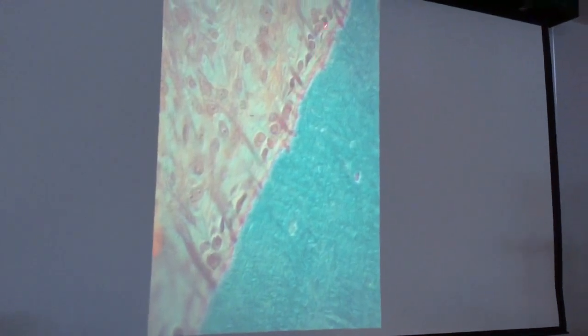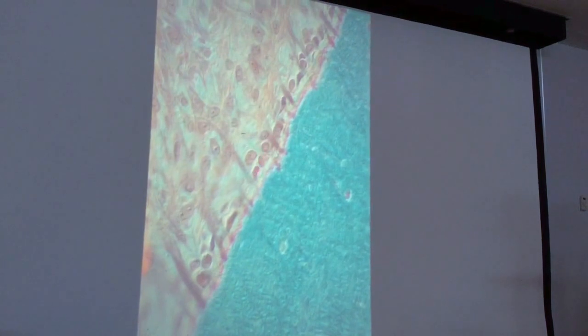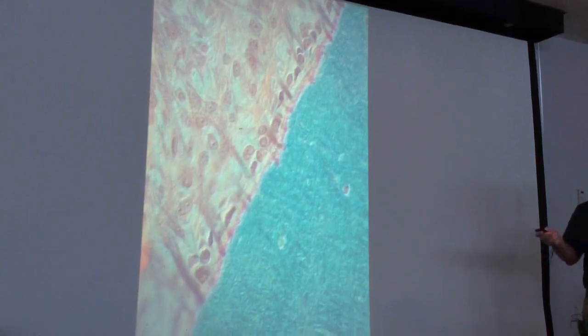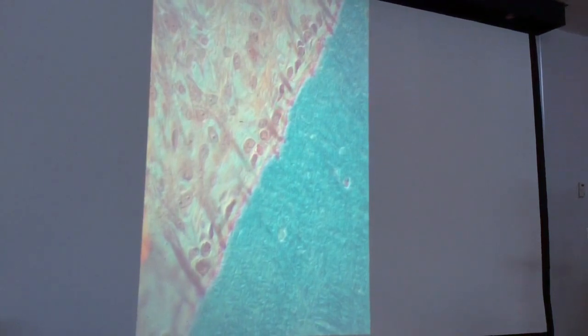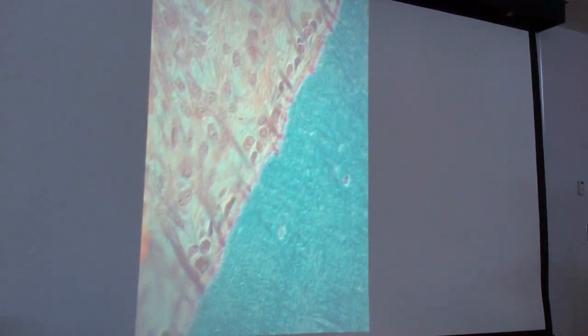Okay. How about these cells we see right there? Cementoblast. This slide will not be on the lab practical. I can't find this particular slide, but I do have the 2x2s of it. Well, we see some cementocyte or cementoblast right along that line right there, and there's a cementocyte there. But we can see the other cells commonly found in the PDL.